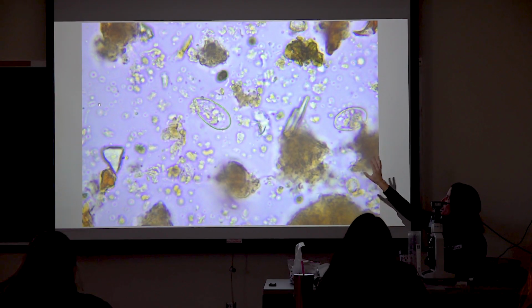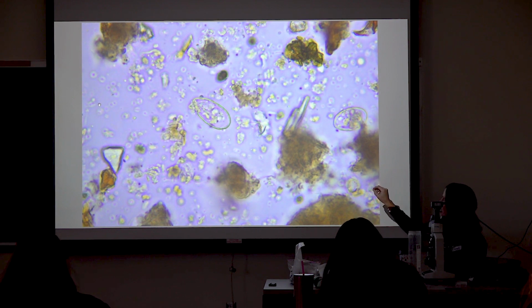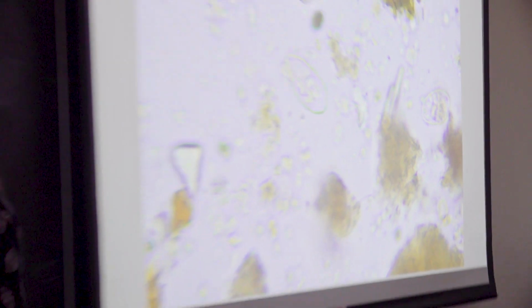And I'm shaking the table. So that motion you're noticing was just me wiggling the table. But you see this general kind of vibration happening in the background. So those are bacteria. Most bacteria just kind of wiggle. They don't have a lot of ability to move around, but they do still move as much as they can. But there are other types of bacteria that are flagellates. So when we say these things, I know there was a picture on one of my slides.